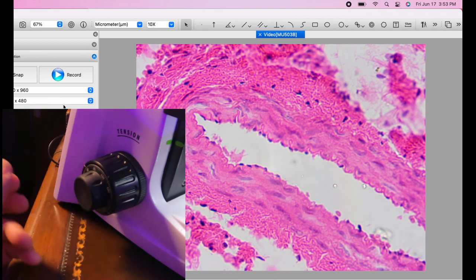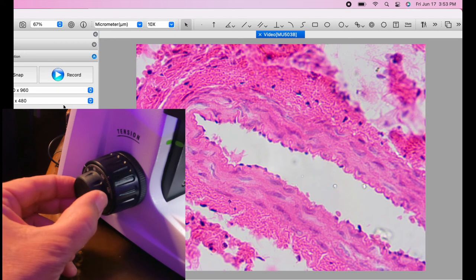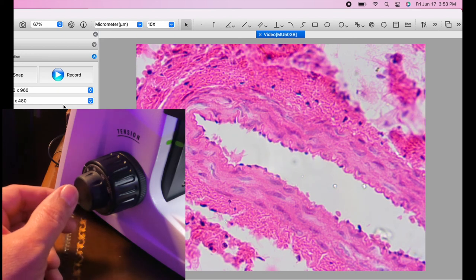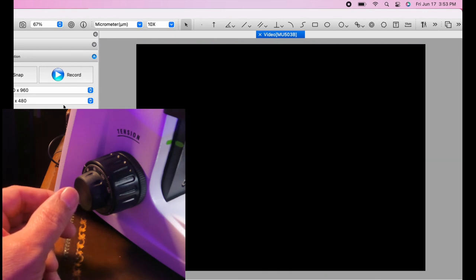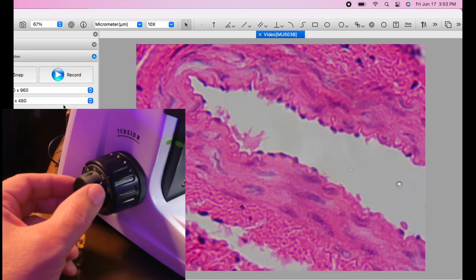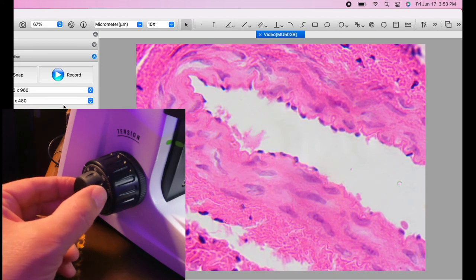Great. Now let's go from the 20x to the 40x. They're just a few degrees of a turn. It was really all that is required. So these lenses are working very well. Now we'll go from the 40X to the brand new 60X lens. And here it's almost in fine focus already. Just make a couple. Boy, yeah, it's really pretty difficult to get it in any finer focus.